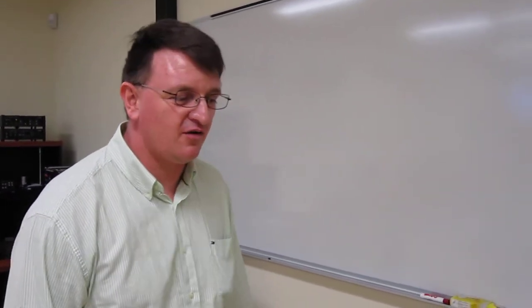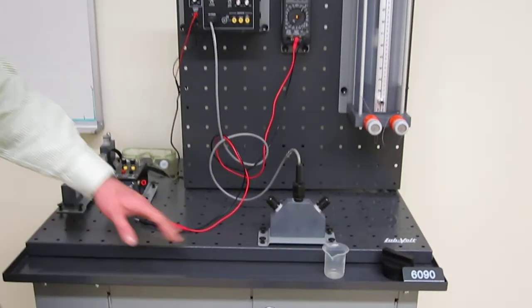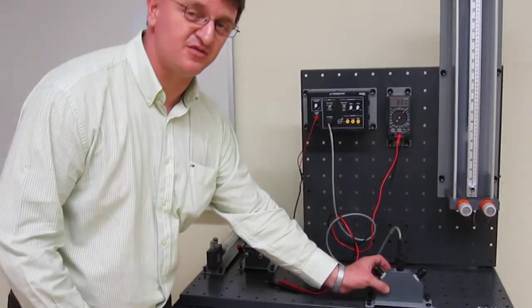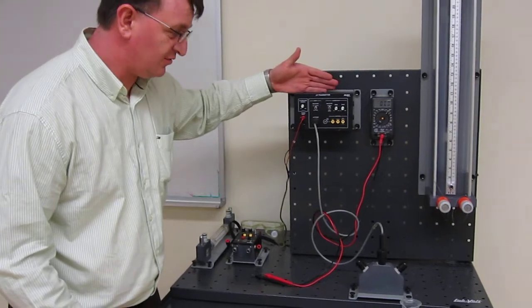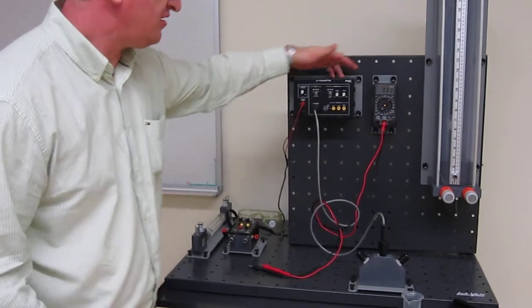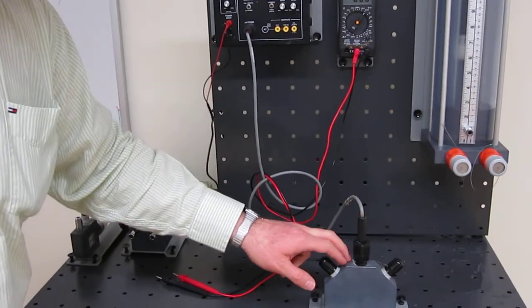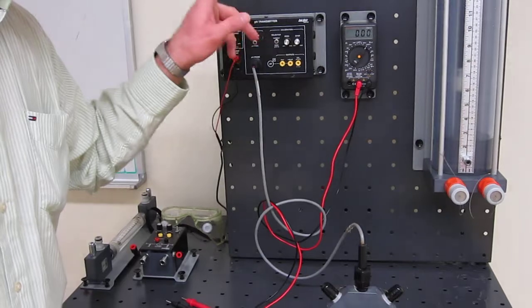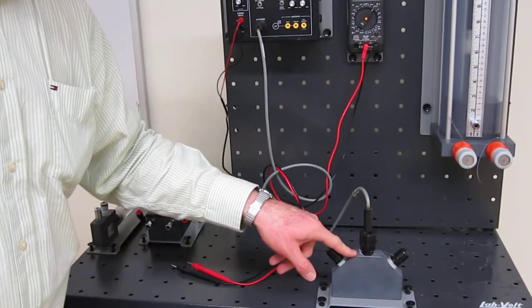Hello, welcome back to the lab bulk training videos. Today we're going to use our 6090 equipment. We're going to learn how to calibrate our pH transmitter with a pH probe. To do so we need the transmitter, a multimeter, and the probe. We're not going to use the probe directly right now, but we're going to calibrate our transmitter to know exactly what our probe is measuring.